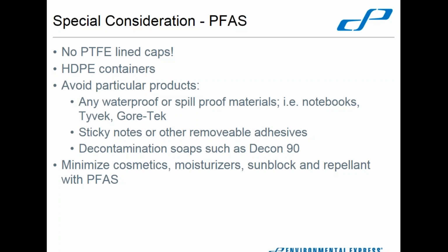It also talks about minimizing cosmetics, moisturizers. Certain sunblocks and insect repellents actually do have some of these PFAS materials in them. So you do need to be extra specially aware of those types of materials.